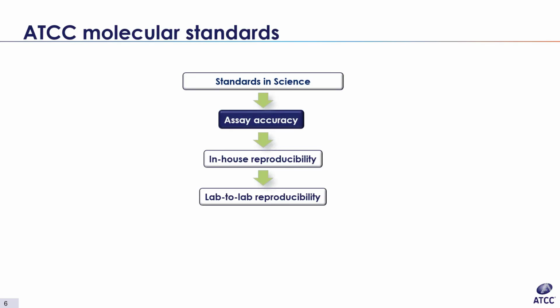When designing an assay, the first use of a standard is to ensure basic functionality. This can be a pretty quick step now with the sequence data that's available, but it can be an expensive one to verify if an extensive inclusivity-exclusivity data set is necessary. Depending on the number of organisms involved, there can be as much culturing and extraction work as there is molecular work. Culture and nucleic acid extraction are expensive and time-consuming, and they can be doubly time-consuming in the case of a contamination event or a culture loss. So they can delay the actual development work, which delays manuscript submissions or product launches. The compound effect is that those extra steps not only cost money, but they delay the payoff of the work.